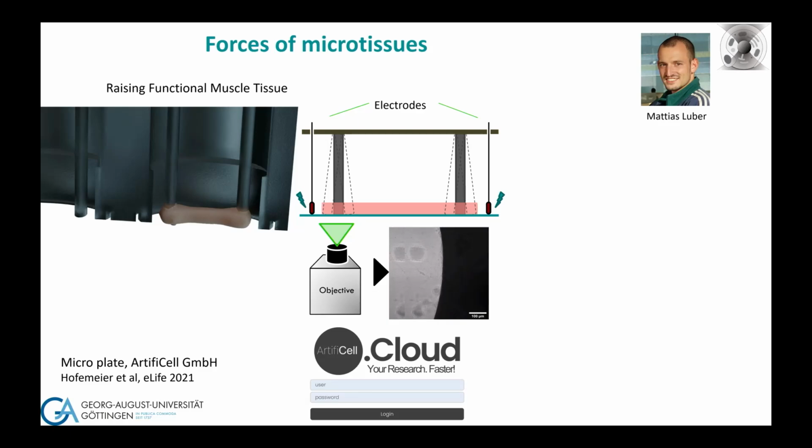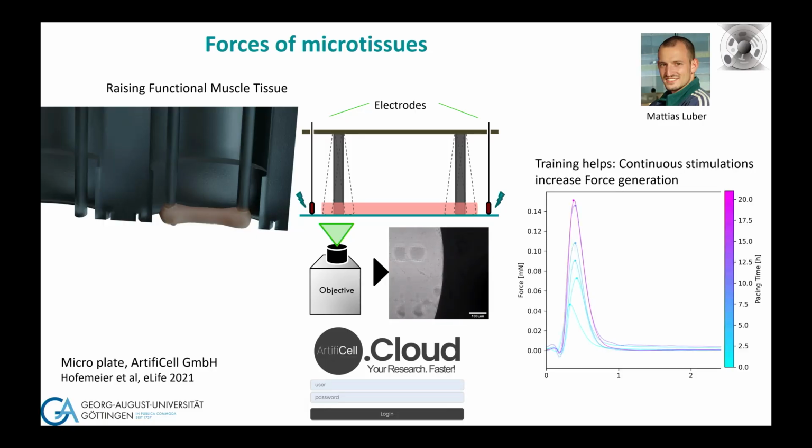So you can also have electrodes and twitch them. Matthias here, for example, quite nicely shows that he's training them over time. Each of these colors is later in time. We start here right after starting. All of this is done after 2 weeks in culture, by the way.